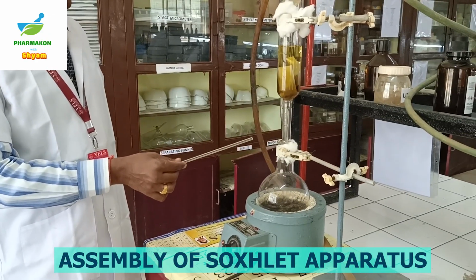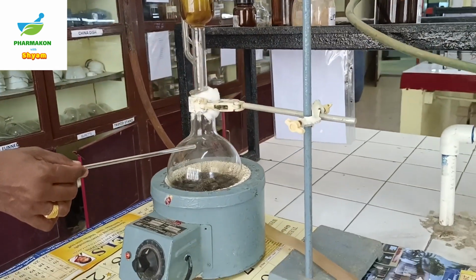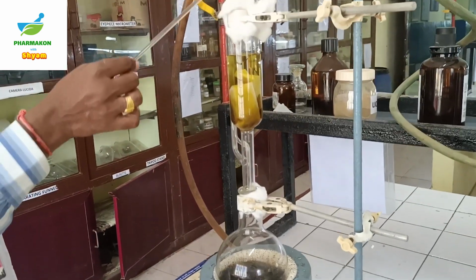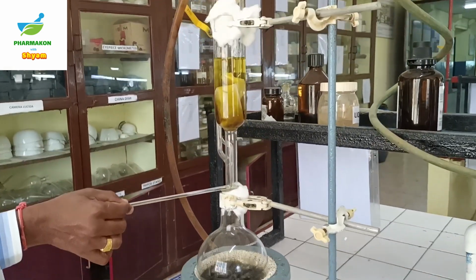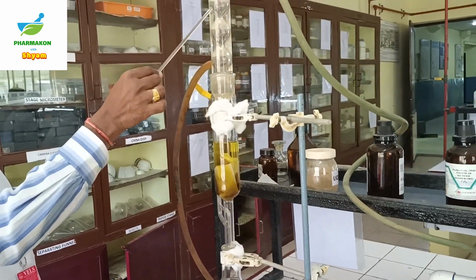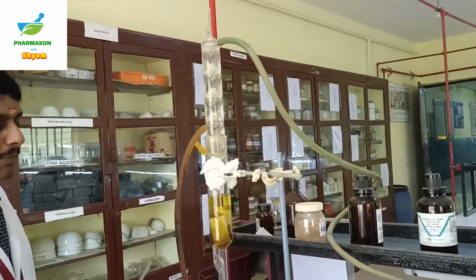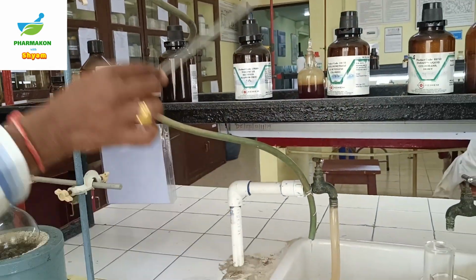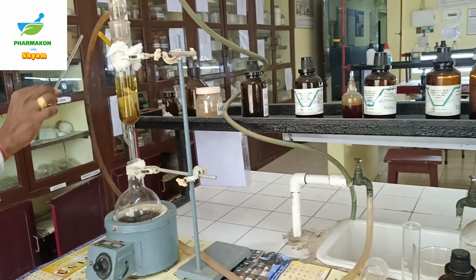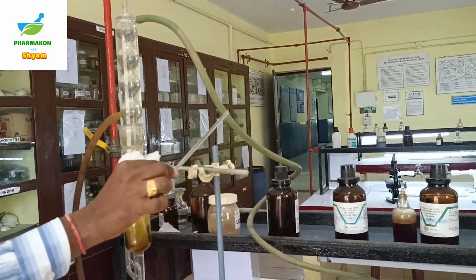The assembly of the Soxhlet extractor. The round bottom flask along with the solvent is kept on the mantle. Then the Soxhlet extractor is placed above the round bottom flask. To the top of the extractor you have the condenser. The bottom inlet is connected to the water tap and the outlet on the other end. So the water circulates from the bottom to the top, so there is continuous circulation of water.